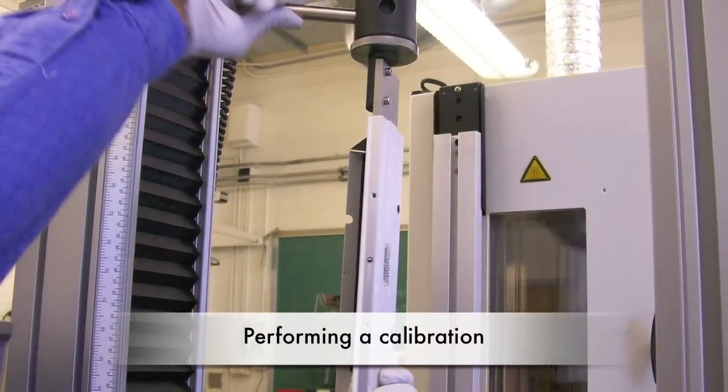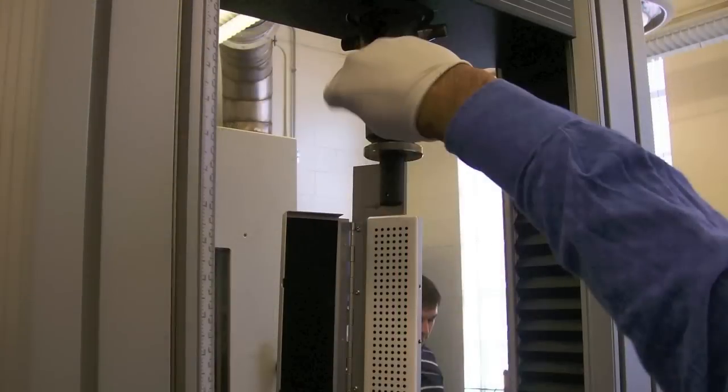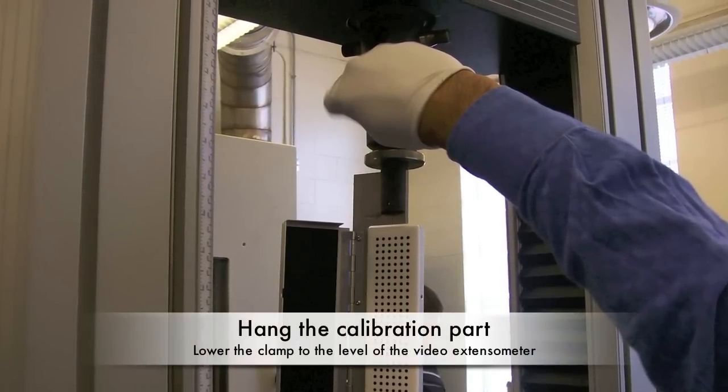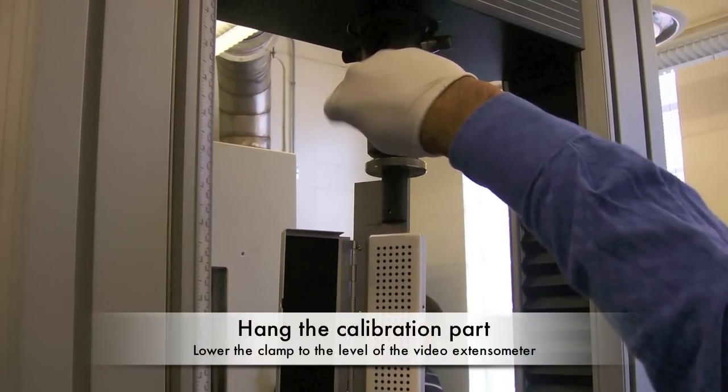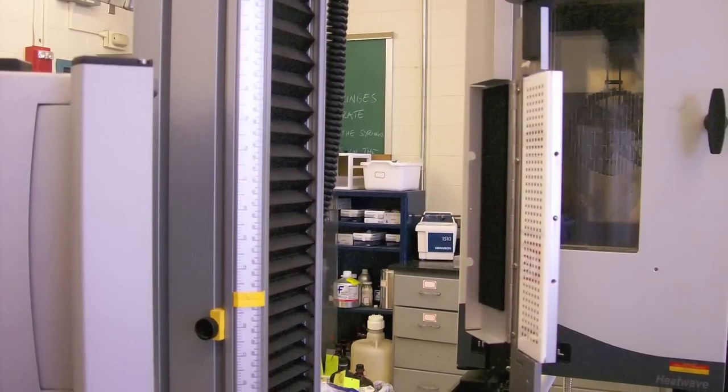For the strain to be correctly monitored, a calibration must be performed every so often. To do this, attach the calibration piece, found in a black box, to the upper holder. Lower the top clamp until the piece is about level with the video extensometer.